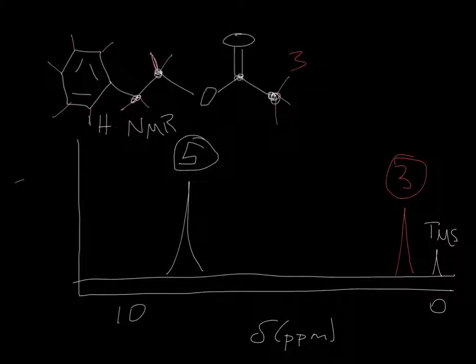Now comes the hard part. We have the last 2 sets of hydrogens. We already know they're both going to integrate to 2 because each one of them's got 2 hydrogens on it. The question, and let me change colors so that way we can tell the difference. So those hydrogens versus these. Was that blue and green, I think? Okay. They both are going to integrate to 2 because there are 2 hydrogens on each carbon that are identical to each other.